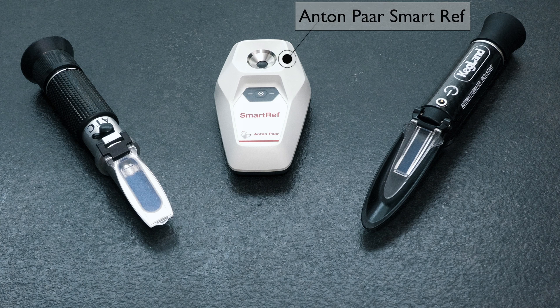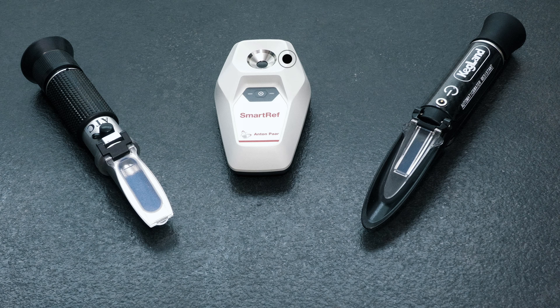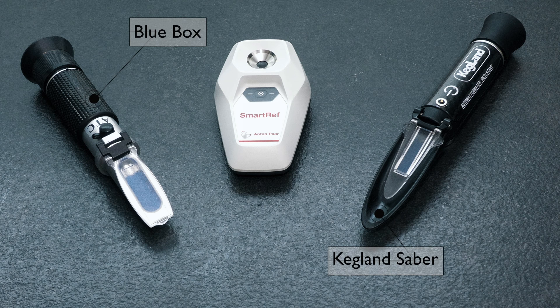As you can see, the SmartRef is back with its ultra accuracy of 0.2 degrees Brix, so as such this is essentially our benchmark device. Also returning are our standard blue box refractometer and Kegland Sabre refractometer.